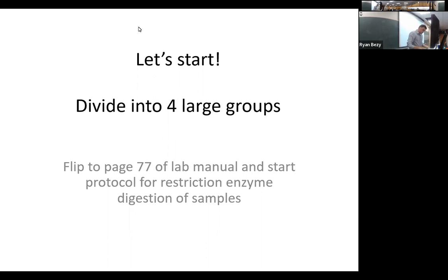I think it's actually, no, it's 77. So it's top of page 77. It says protocol for restriction enzyme digestion. You're going to start doing this. I have the samples up here for you guys to work with and follow along. We're going to get that set up.